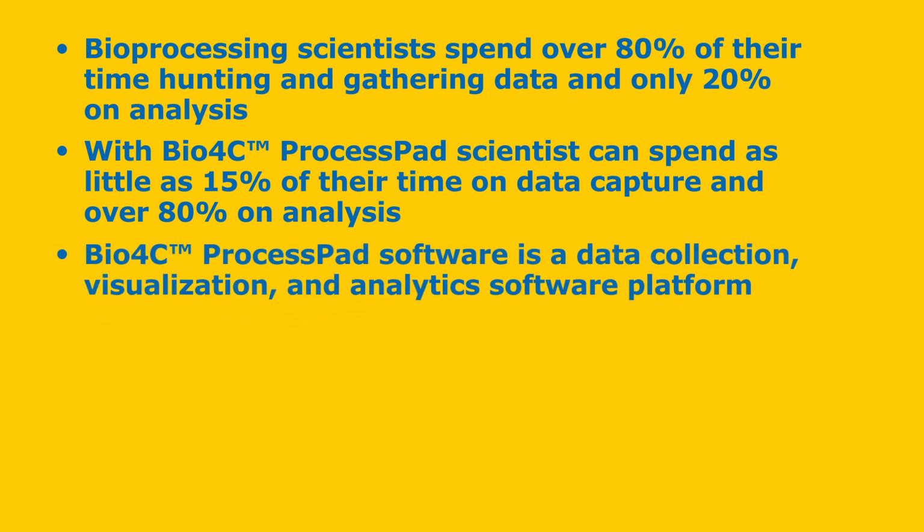Bio4C ProcessPad software is a data collection, visualization, and analytics software platform that facilitates 21 CFR Part 11 compliance and enables bioprocess monitoring, lifecycle management, reporting, investigations, and continued process verification, CPV.